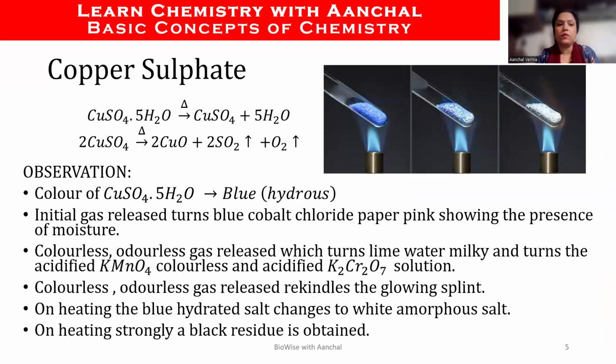Okay. Moving to the next, that is copper sulfate. Copper sulfate pentahydrate is a hydrated salt which is called blue vitriol.